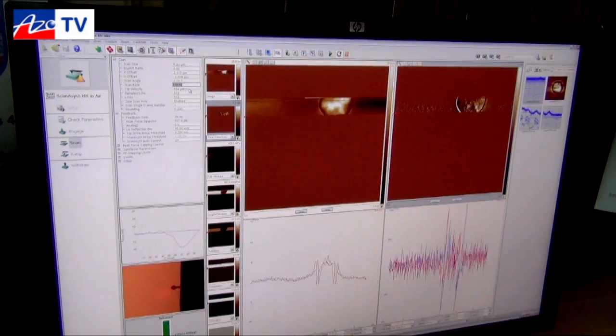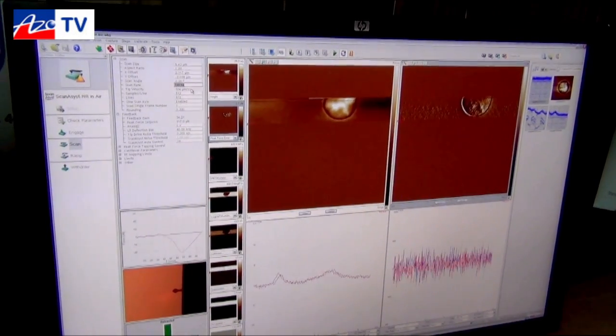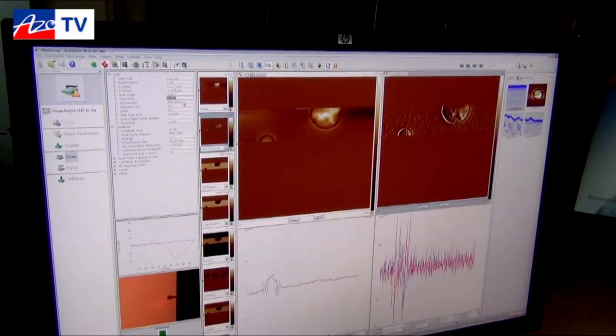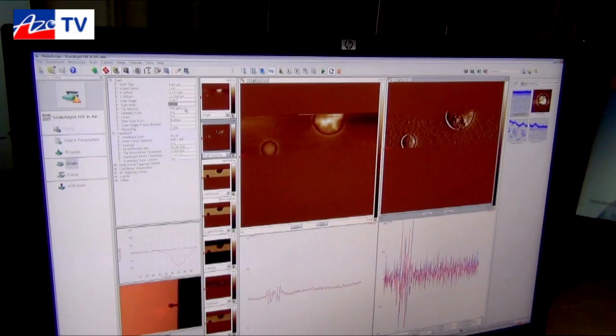So now you have your same multi-mode with the same great quality topographic data but a lot faster. With ScanAsist, with Peak Force QNM, and with ScanAsist HR, you can see some of the benefits of Peak Force Tapping. Thank you.